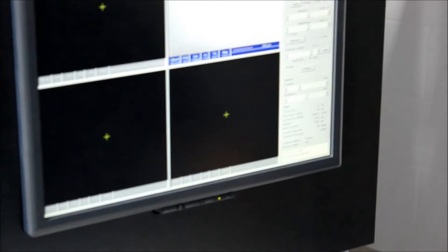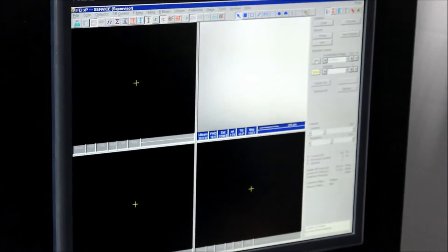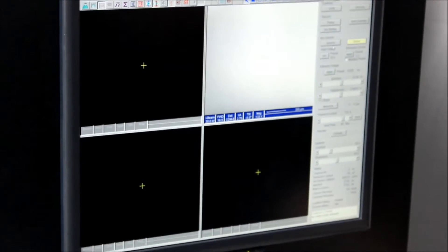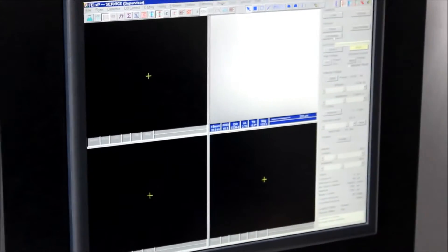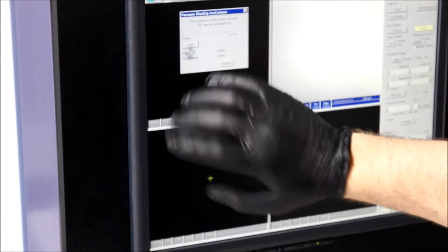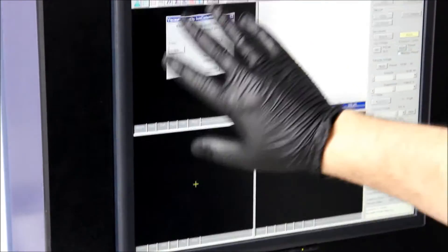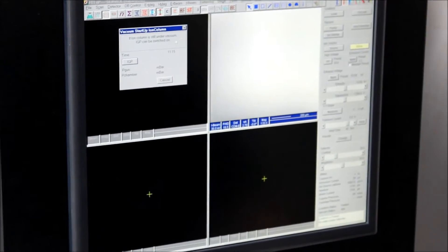What we've done is turned off the source on the ion column and turned off the high voltage on both, and turned off the high tension button. It's also really important to make sure the ion IGP is off — it's off right here, we already turned it off. If you go through this procedure and this is still on, you're going to be pumping on atmosphere and it will be really bad for the IGP. So it's very important to make sure that that's turned off.